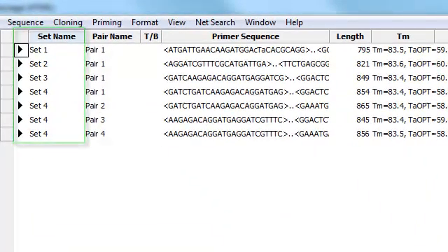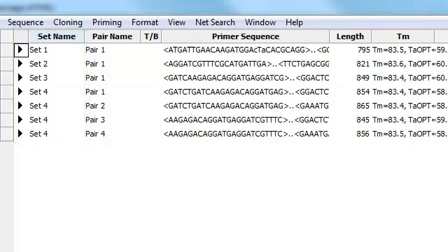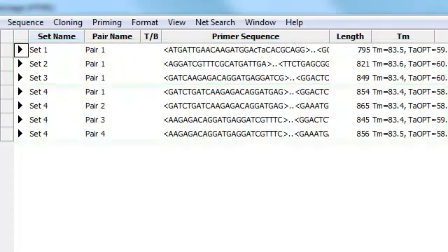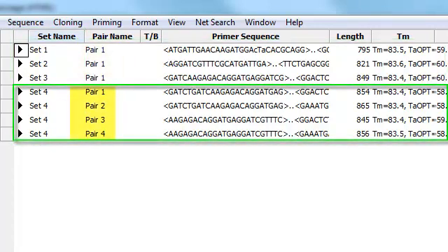You'll notice that I have four sets of primers here. The first three sets each contain one primer pair, and the last set contains four primer pairs.